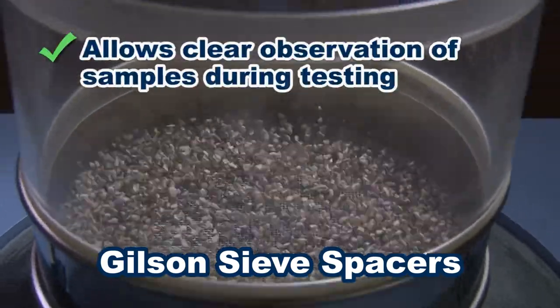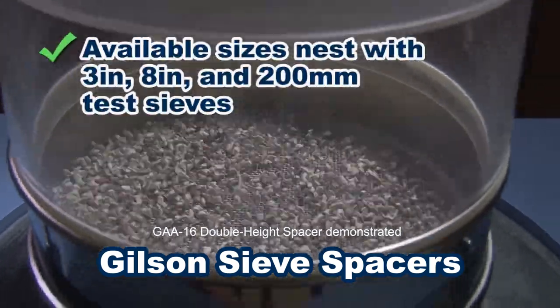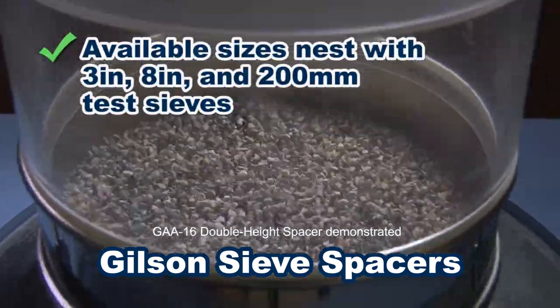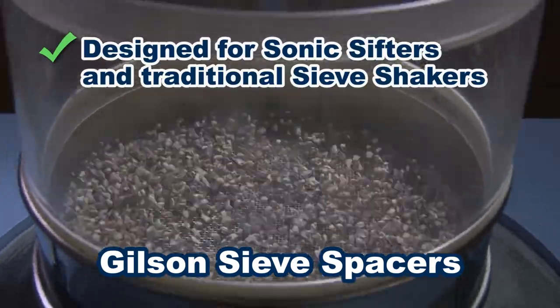Gilson sieve spacers provide a clear space for viewing sieving action of sample material, or ensure proper stack height when fewer sieves are required for those special testing applications.